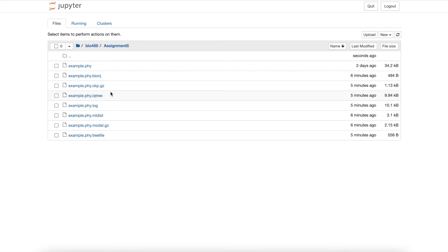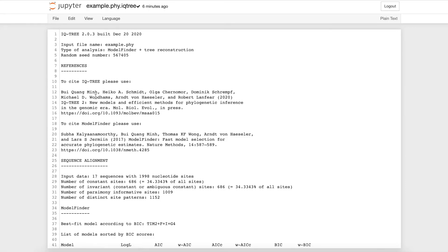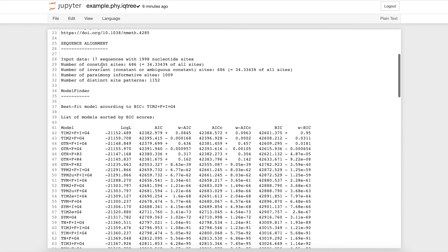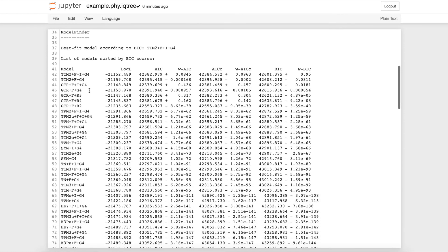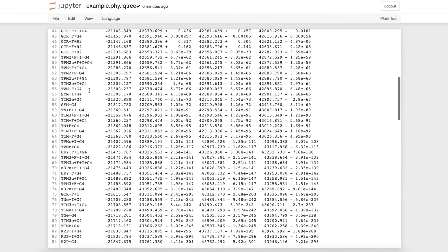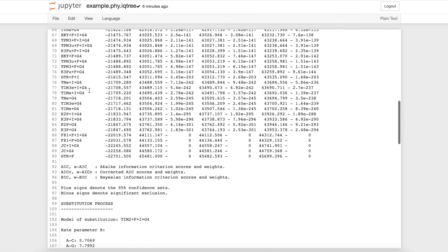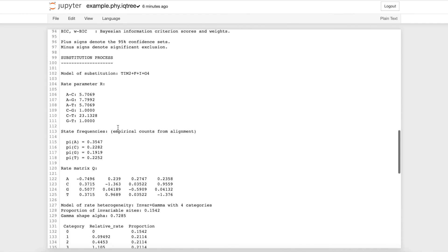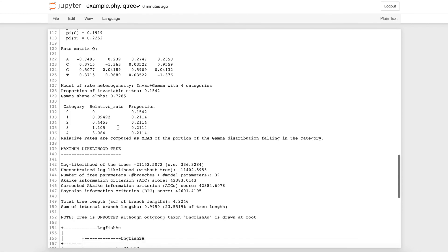We will navigate into the iqtree file to review our inferred phylogenetic tree model. The reference header here shows how to cite IQ-Tree 2. The sequence alignment header shows information on your input. The model finder shows the program's reasoning behind the best fit model, which isn't really self-readable. The substitution process shows statistics of the run. And finally, the phylogenetic tree.